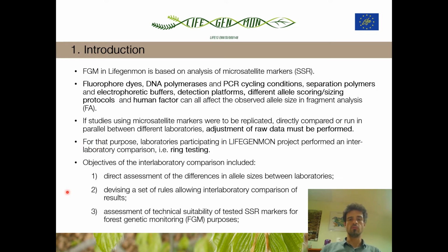Objectives of the interlaboratory comparison included to directly assess the differences in allele sizes between laboratories, devise a set of rules allowing interlaboratory comparison of results, and to assess the technical suitability of tested microsatellite markers for the forest genetic monitoring purposes.